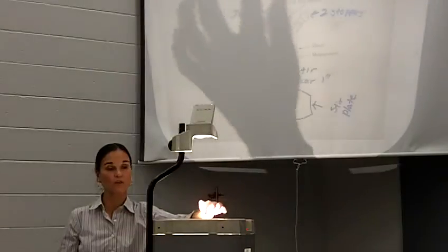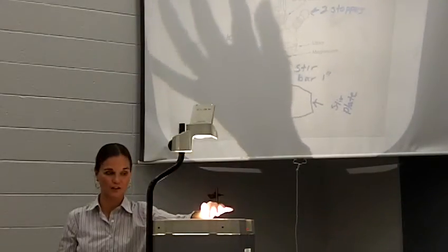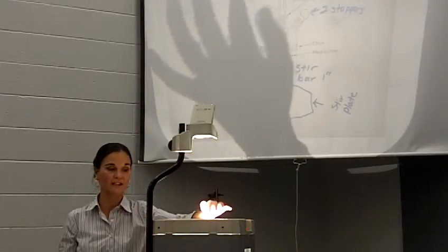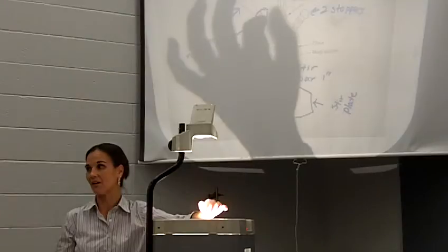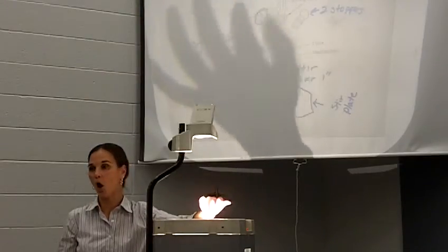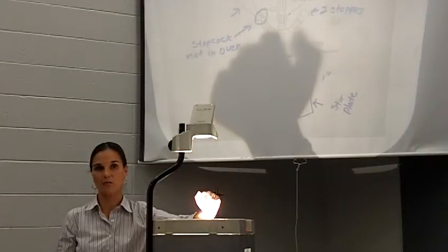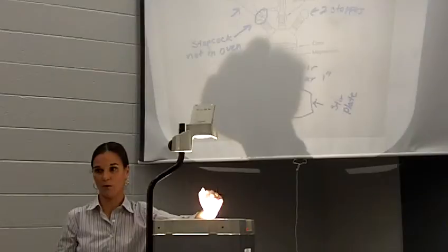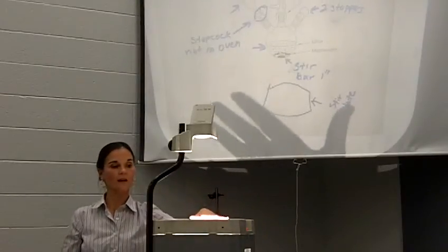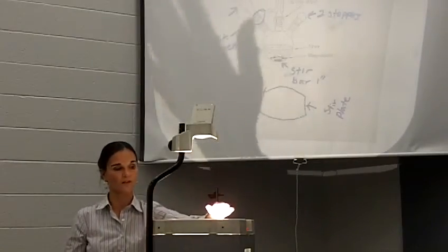That's why we make this solution here, okay? And that's why we have you add the ether first. That way, if our stopcock isn't closed off, at least we've got only ether in there and not alkyl bromide, okay? So this alkyl bromide always goes in dropwise. We don't want any exciting moments in organic lab this week, okay? Because it will be exciting. It would involve 2 condensers and all sorts of things. We don't want to do that.